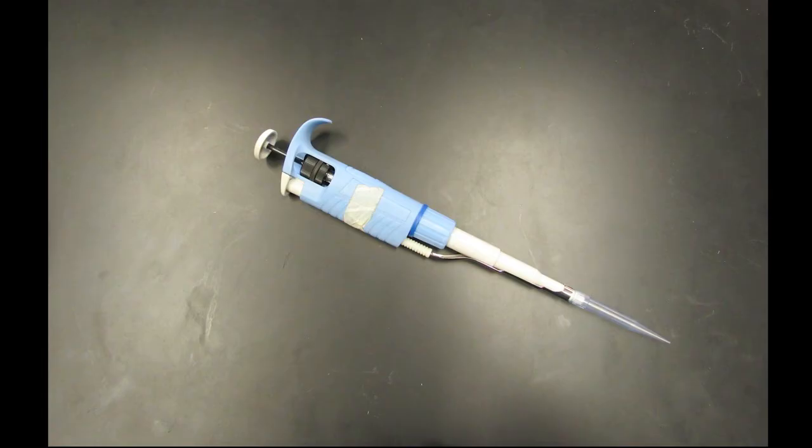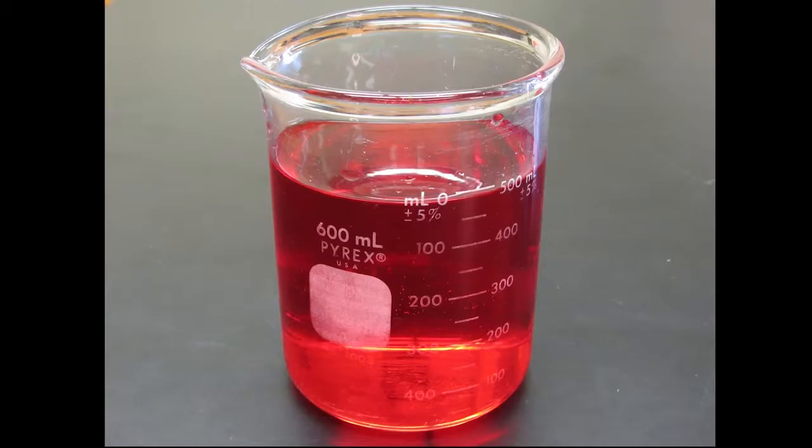Be sure to choose the correct device for the job. But what about a beaker? Can't we use those? They also look pretty similar to a measuring cup.